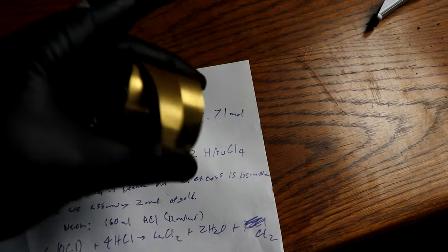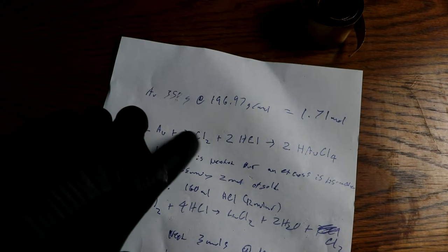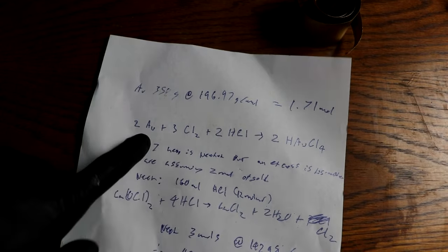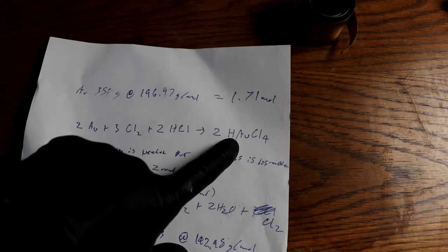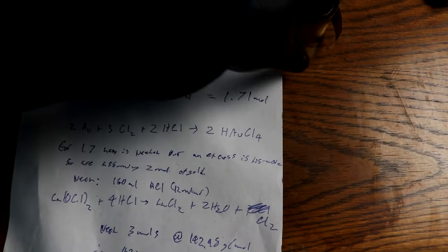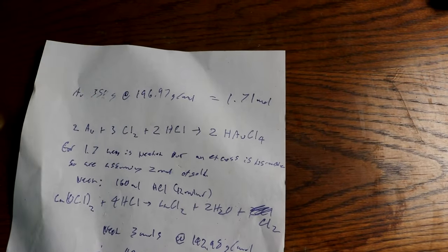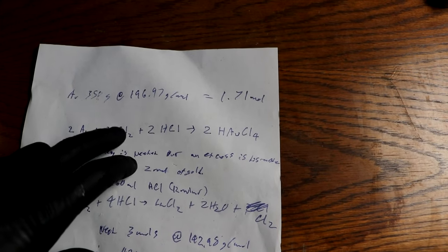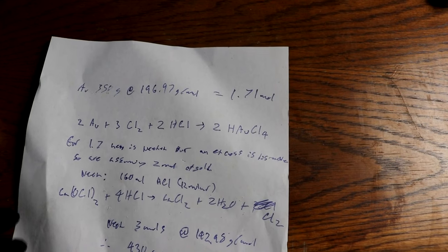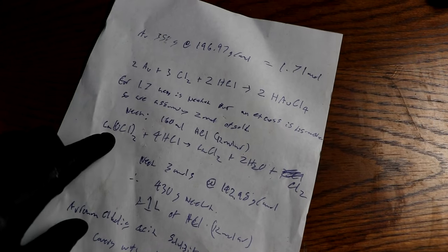I am going to do this in batches, so we will reduce that number. I don't want to do all my gold all at once on an untested process. So, this is the equation for the dissolution. Elemental chlorine, elemental gold, a little hydrochloric acid, and it dissolves it, making chloroauric acid. Now, I was talking to some Patreons, and we decided that it might actually be better to use bromine instead of chlorine. So just replace the Cl with Br, and the equation should be the same. I was going to make the chlorine using calcium hypochlorite. We may actually use calcium hypochlorite in order to produce the bromine, but there we go.